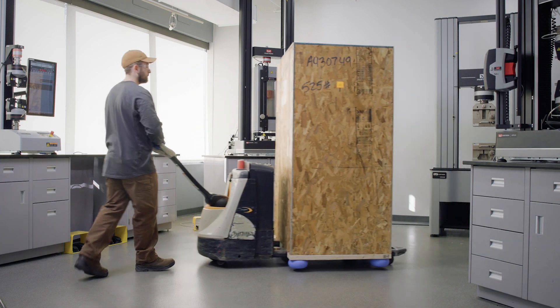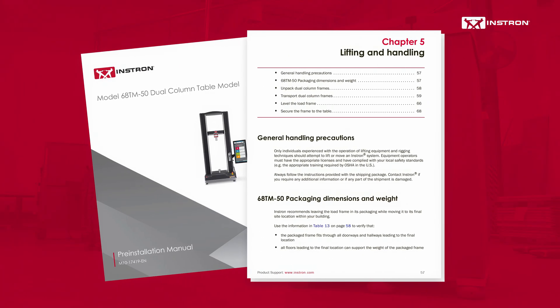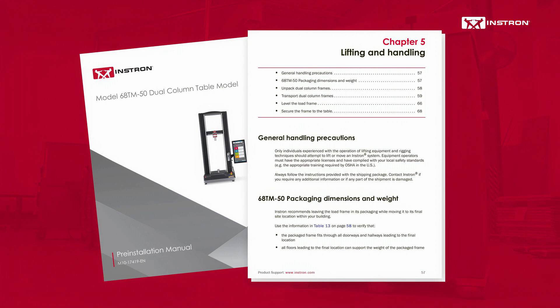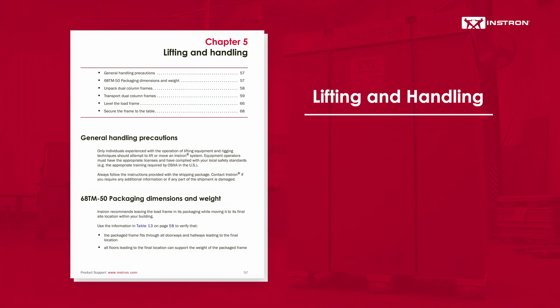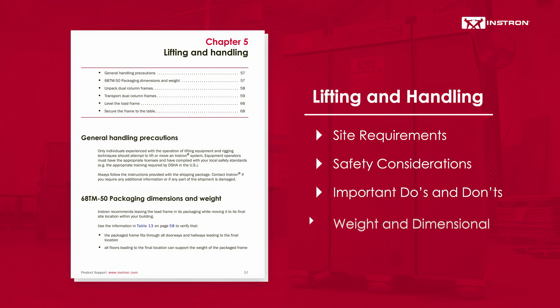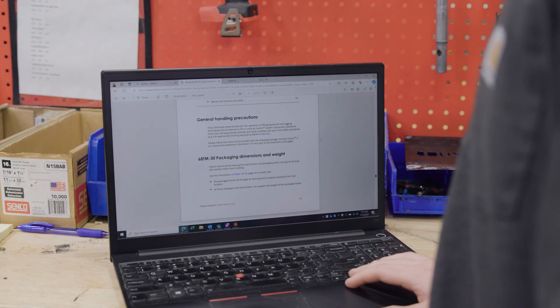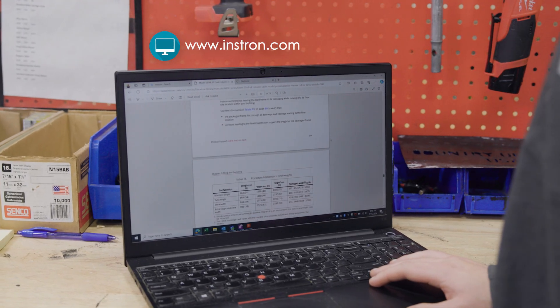Before moving your testing system, it's important to review the lifting and handling section of the pre-installation manual included with your frame. This section provides essential information about site requirements, safety considerations, important do's and don'ts, and the weight and dimensional information specific to your system model. If you don't have a copy, one can be downloaded from instron.com.